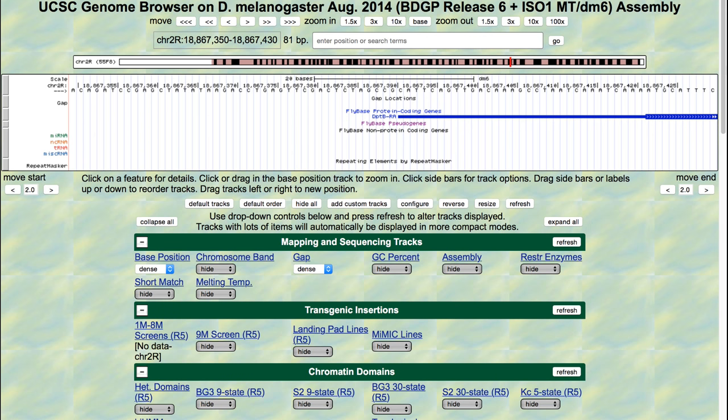Short Match can be used to search for short sequences between 2 and 30 bases long. For this example, we will use Short Match to search for the initiator motif, or INR. The INR is a motif associated with the RNA polymerase II core promoter, and previous studies suggest that transcription factor II-D, or TFIID, binds specifically to this motif. The INR motif, when found, typically begins two bases upstream of the transcription start site, though the location can vary by a few bases.